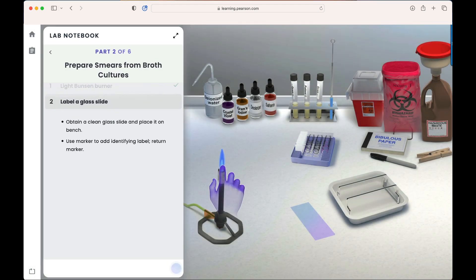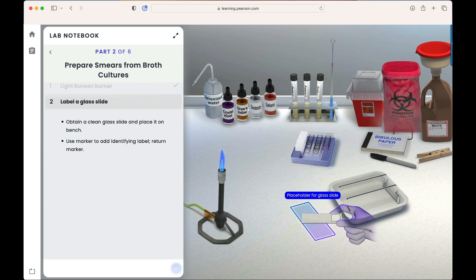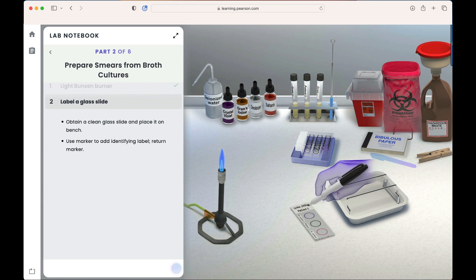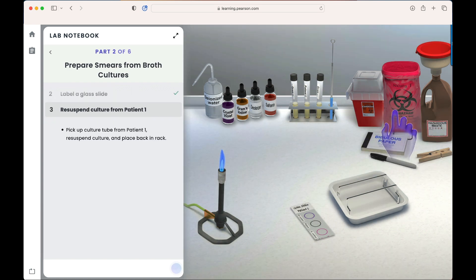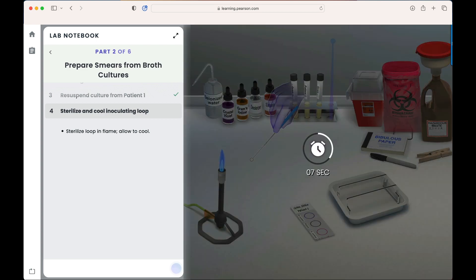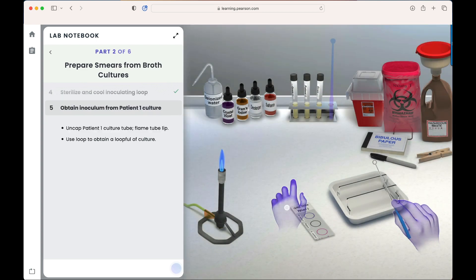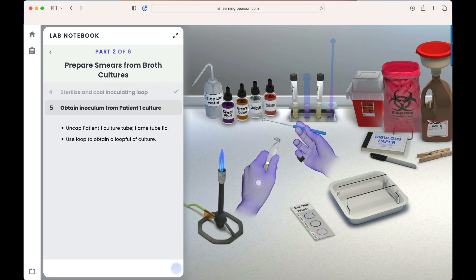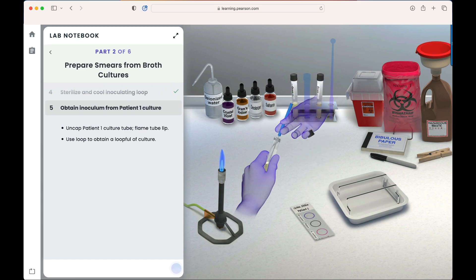First, we're asked to light the Bunsen burner. Next, label the glass slide. Resuspend culture from patient one. Then sterilize the inoculating loop and allow it to cool. We obtain the inoculum from patient one's culture, which includes uncapping the tube, flaming the tube lip, and obtaining a loop full of culture.